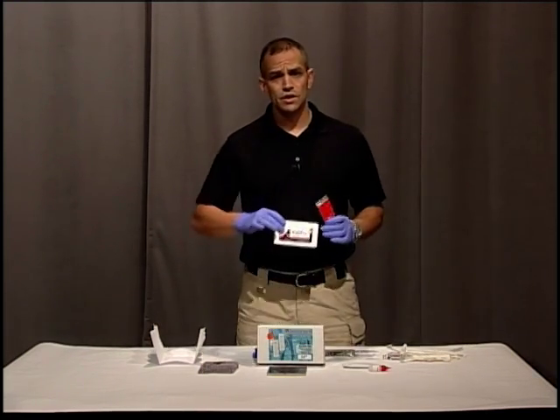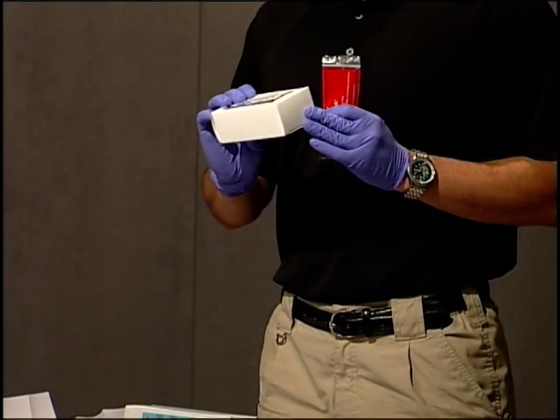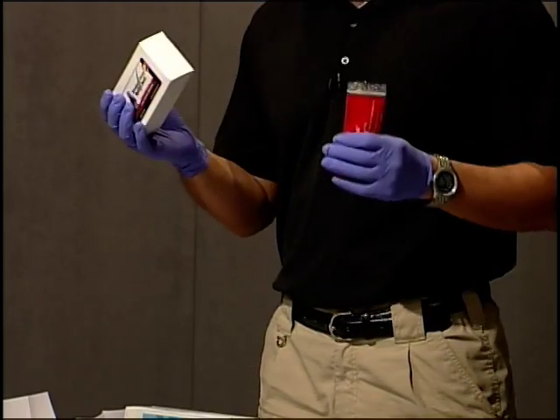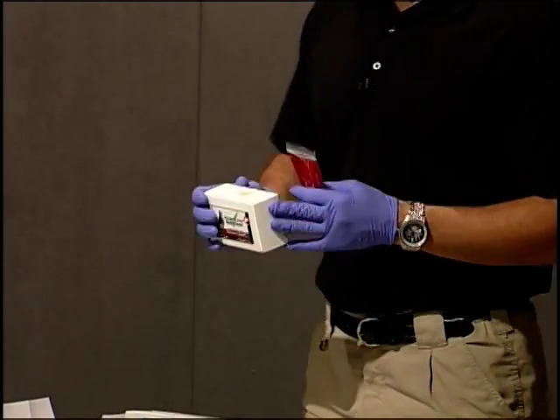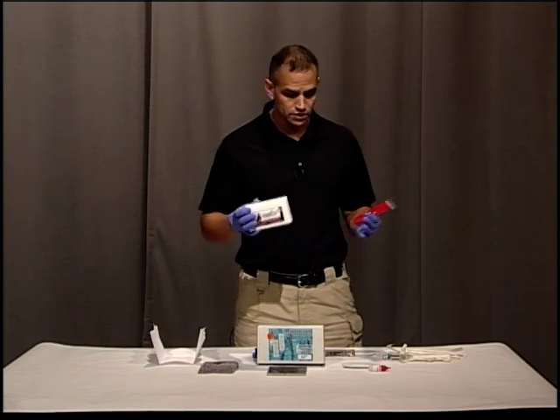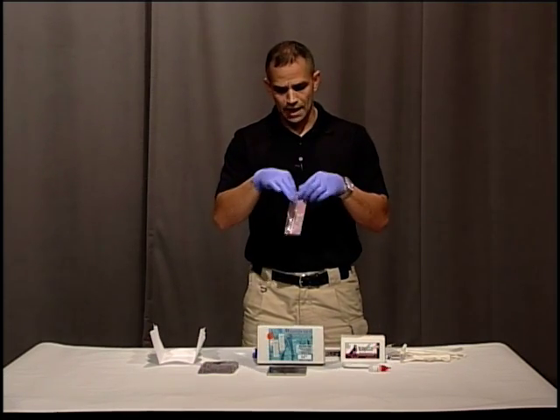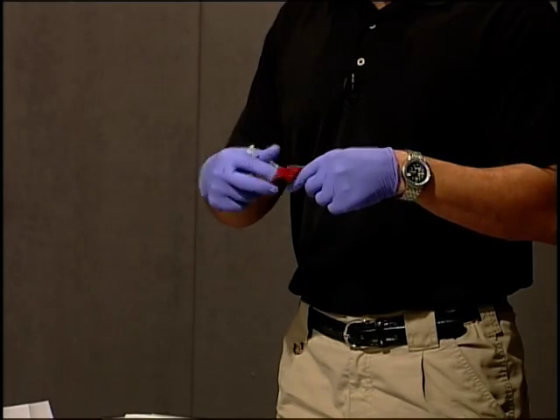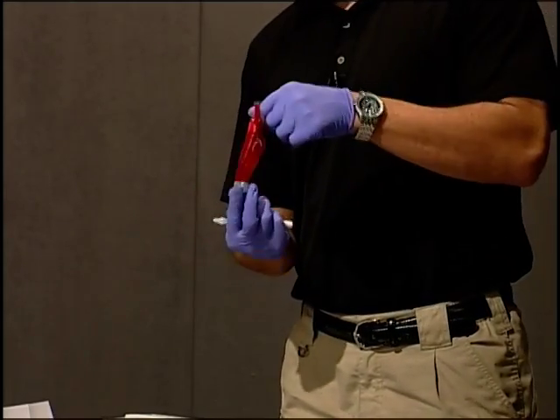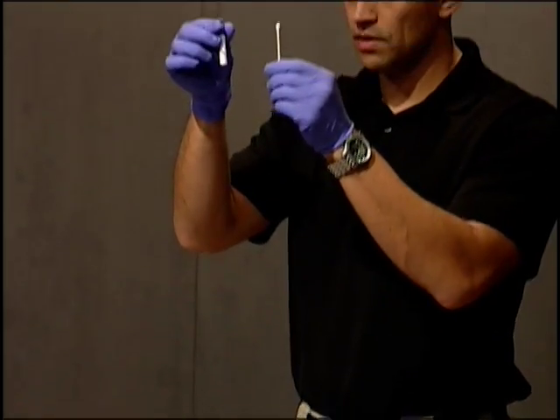To do a presumptive blood test, we're going to use these QuickCheck Bloodstain Green. They're very simple and easy to use, but it's just going to tell you that your stain is blood — not whether or not it's human or animal blood. It comes in a little package, and inside the package you have your swab and a dropper.